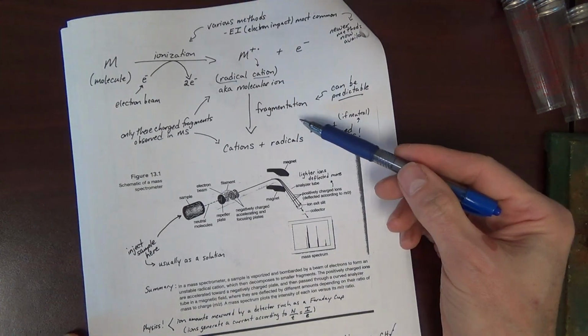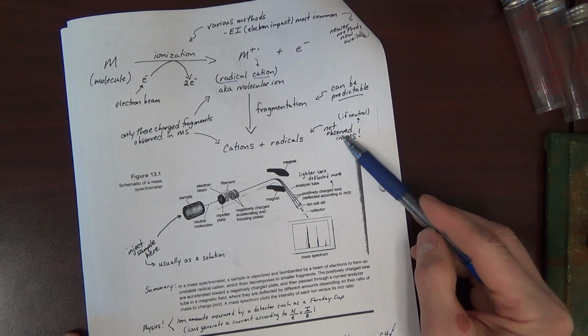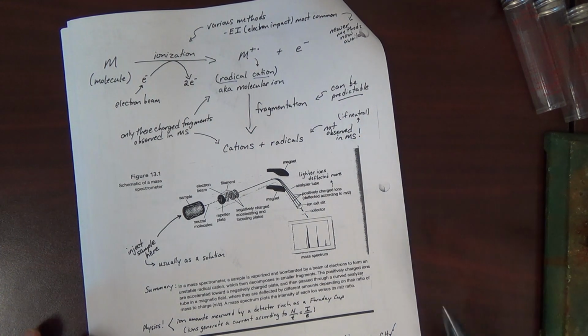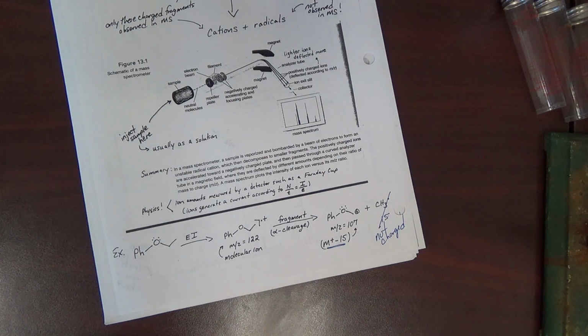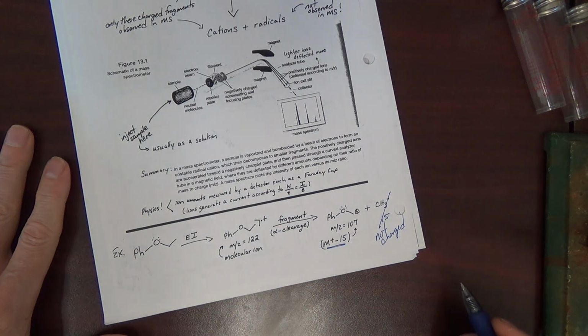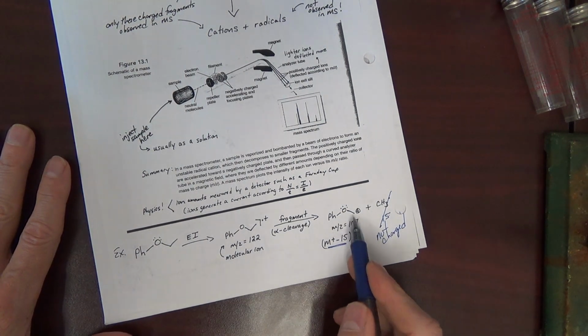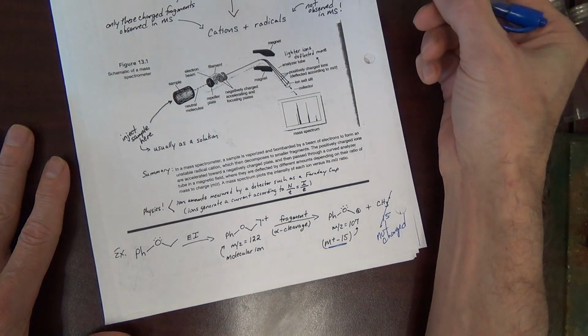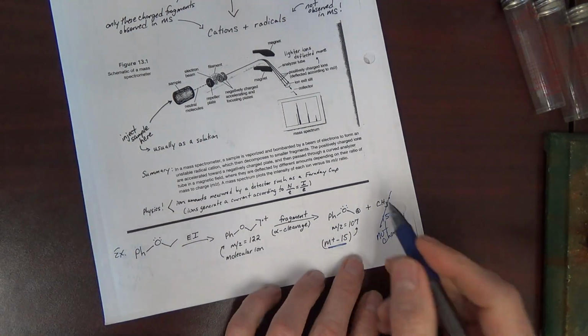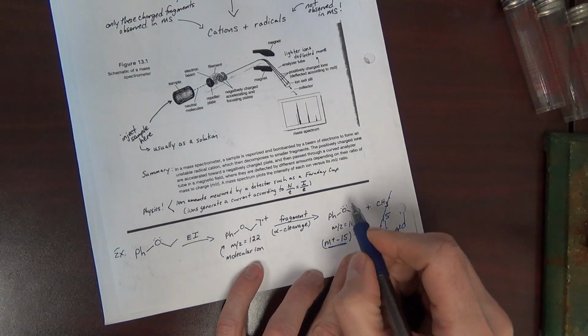As we set up here, neutral fragments will not be seen in the mass spec. Okay. By the way, let's point out why this is a good fragment, because we will try to predict fragments. This should be very predictable. One reason this is a good fragment is because it's resonance stabilized.